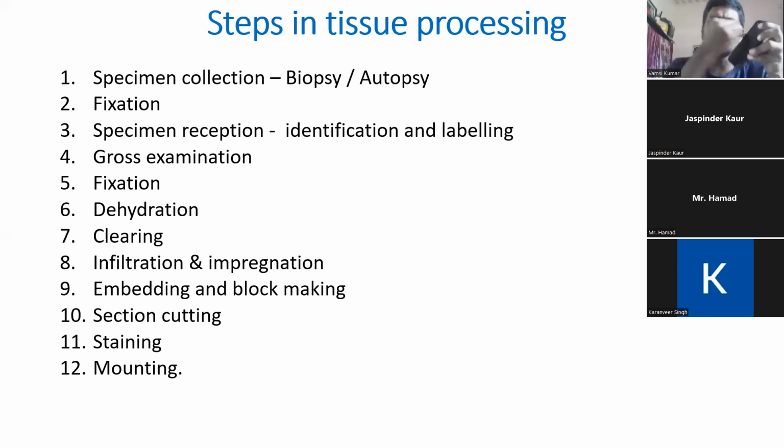If you identify any fibers, then you need to say it is a fibrous organ, the cut surface has fibroid. If it has caseous necrosis, sometimes upon cutting, it will be like cheese inside. That means some part of the tissue has decomposed, either due to bacterial infection or anything. So we must give the description of the cut surface also.